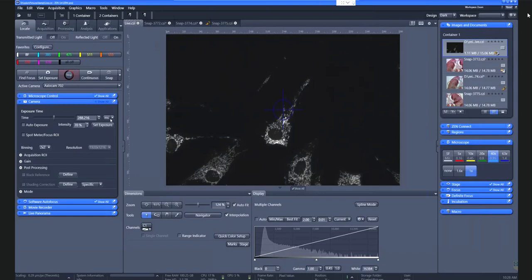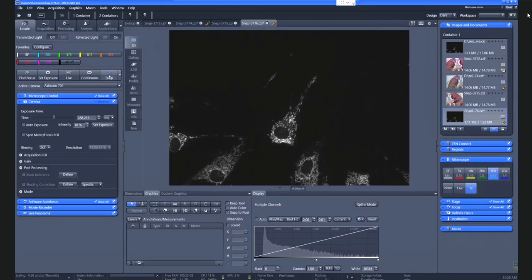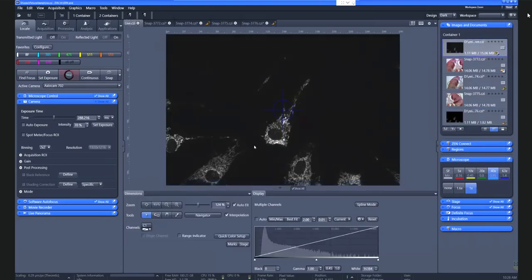Okay, let's do a snap. Right now we can see the snap looks much better than the live image we had to face before. This is giving us much better contrast, much darker background, brighter intensities here. Again, we might want to adjust this a bit and hit this best fit button, because we already know we do not alter the intensities but just the display. So how is this with this very crisp image and maybe the little bit grayish live image here?